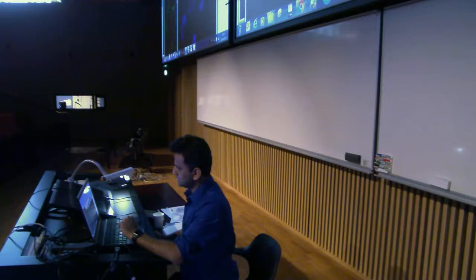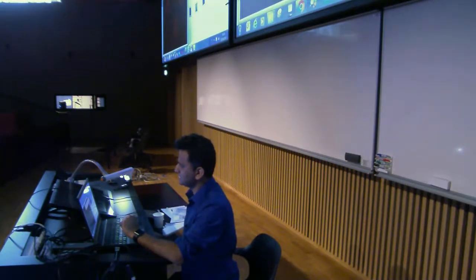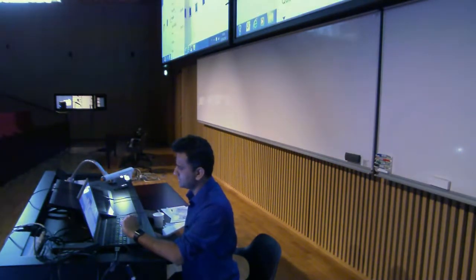But let's say that this is not calibrated. How to set a calibration? Of course, you go to the line tool and just draw a line, and now it says its length is 6.63. I will not do it on this image because this is already calibrated. Let's go for something which is uncalibrated. That makes more sense. Let's go for the real example.